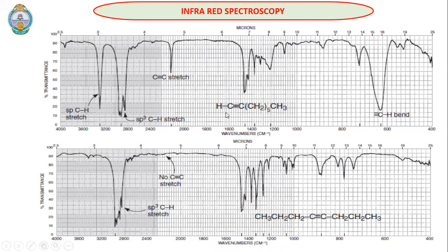When we look at the alkynes, the C≡C band, we cannot miss it, because in the range from 2400 to 1800 we don't observe any other peak. So in all cases it will be free. But if you have a C≡C or C≡N, then you will get this. If you have C≡C, we do observe this at 2150 cm⁻¹.